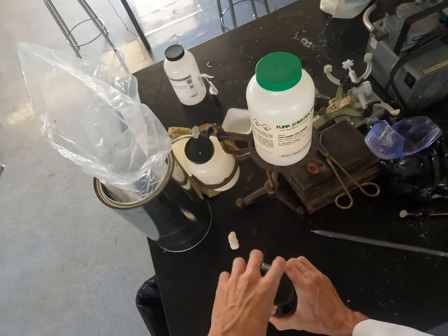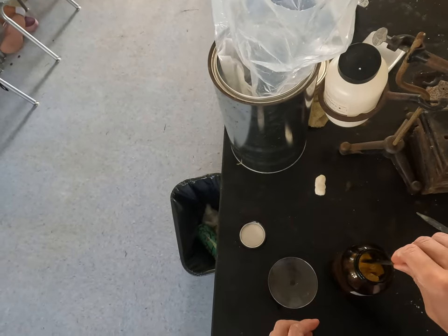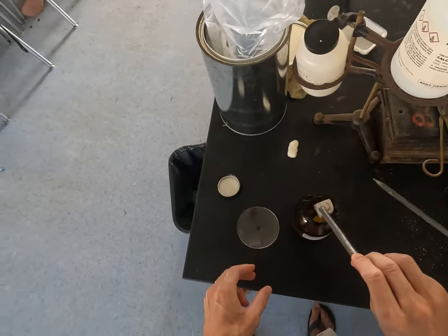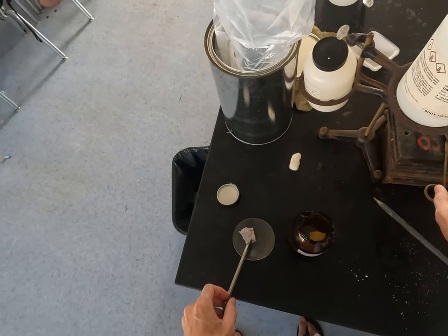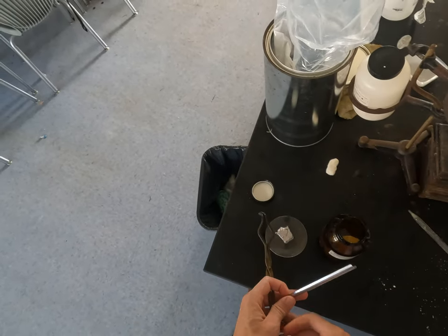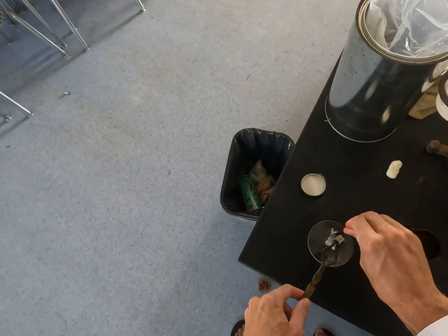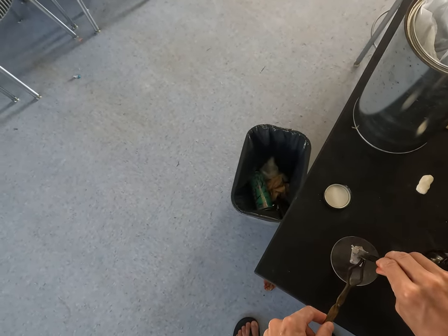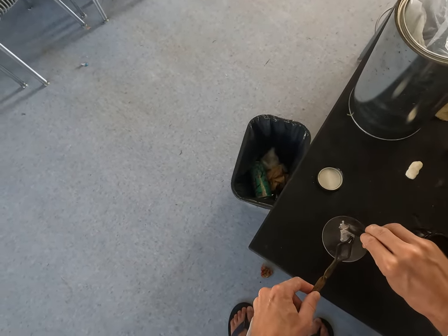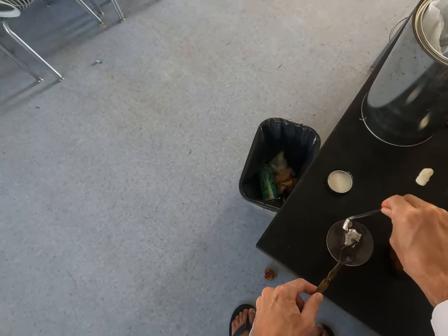Okay, at popular insistence, we're doing this again. It would combine with the water in your skin. You probably wouldn't catch on fire, but it would give you a pretty serious chemical burn. So I don't recommend it.